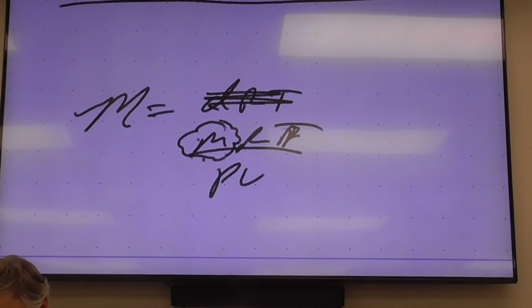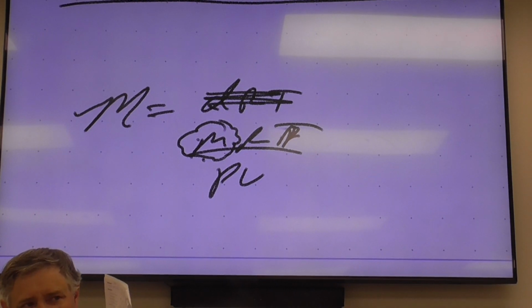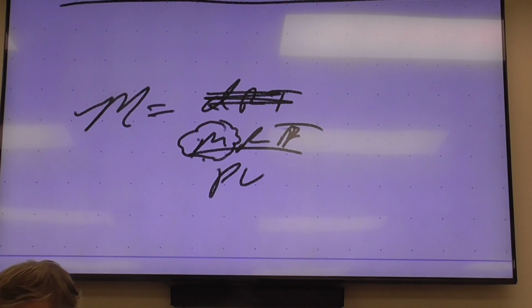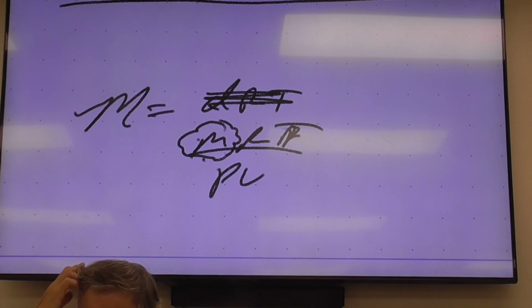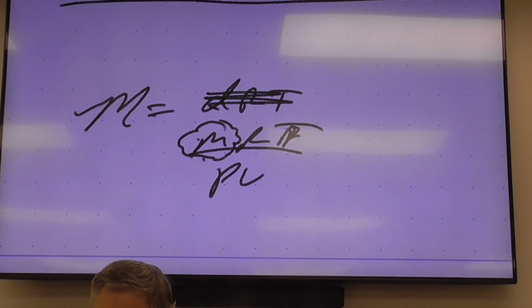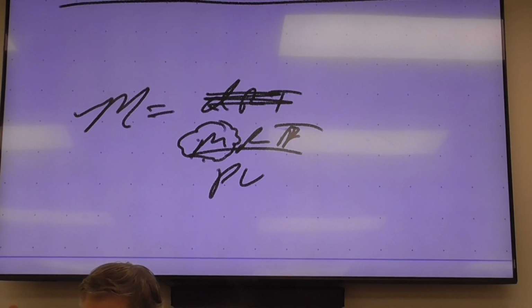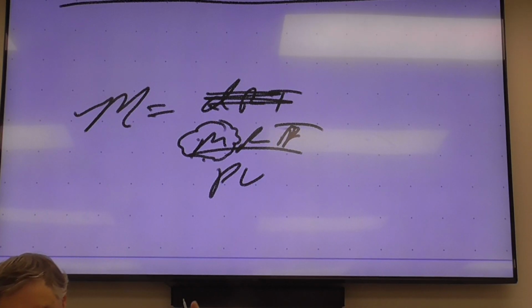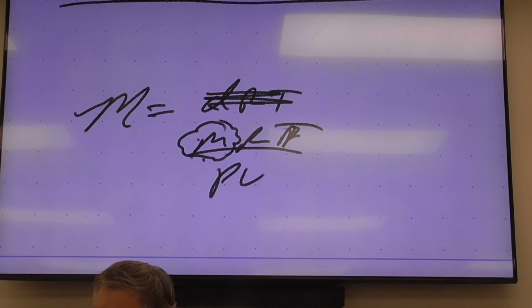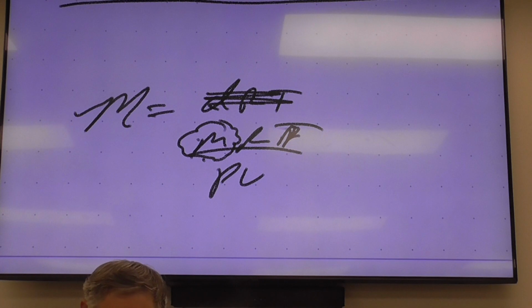If you look over here on this third page, the one that's got experiment 9 and all the data tables, this is very important in how you sequence this. You need to label each pipette 1, 2, or 3, and I don't have Sharpies. You have to keep track of them. I'm going to have the big fancy scales out, so you're going to find the mass of the empty pipettes before you put anything in them.